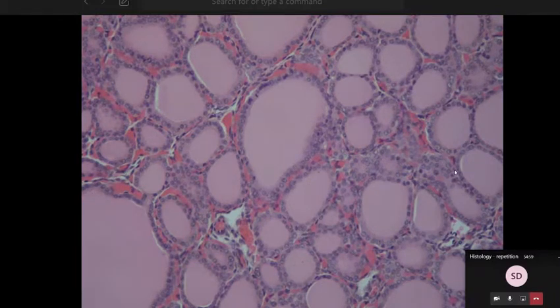And if you see such a place with densely packed nuclei, or a place which looks like this, you have two options. The first option, and I think it's probably the correct one, is that here you also have a follicle, but you have cut your follicle just through the follicular cells, okay?